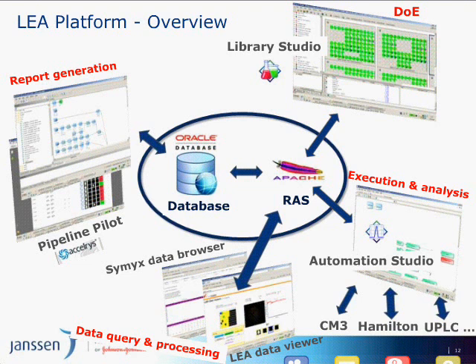For example, when you're taking images to check whether your formulation is able to dissolve your compound, besides the automatic algorithm to look at whether it's clear or not clear, you can give a mark on that image to say, okay, it's clear or not clear, to double confirm. And all this information will be saved in the LEA database directly.